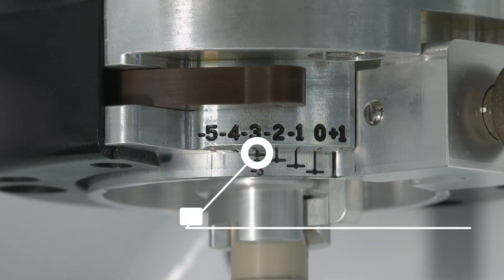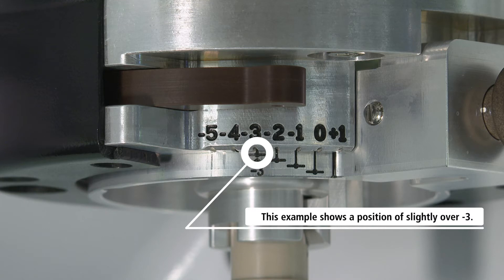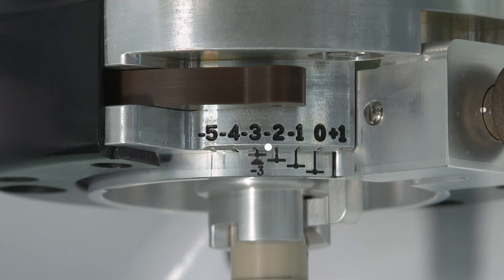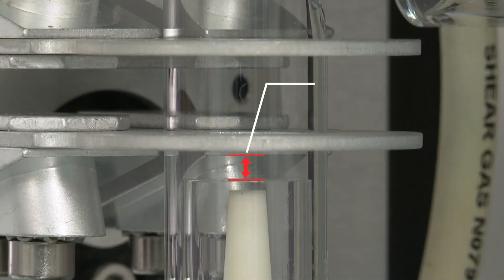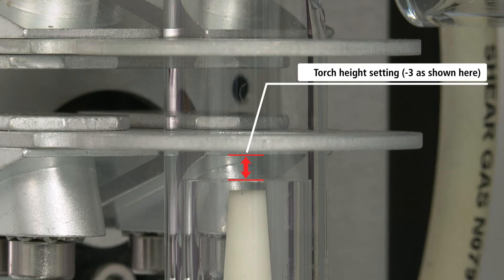Typical settings are minus 3 for aqueous samples and minus 4 for oils and organic analysis. This setting indicates the distance from the auxiliary tube of the torch, the inner tube, and is that many millimeters below the bottom RF plate.